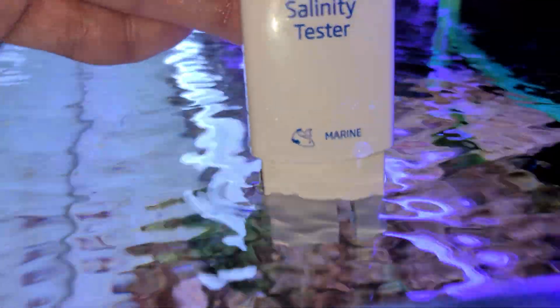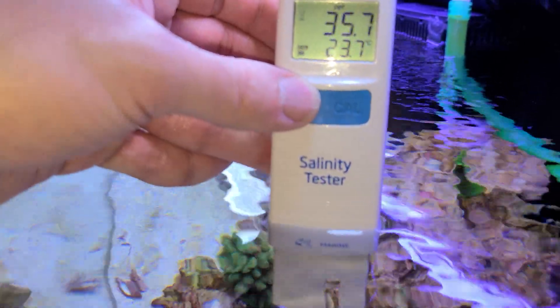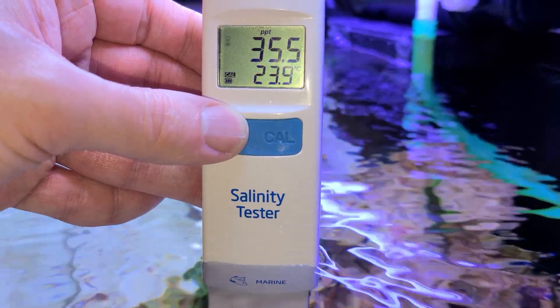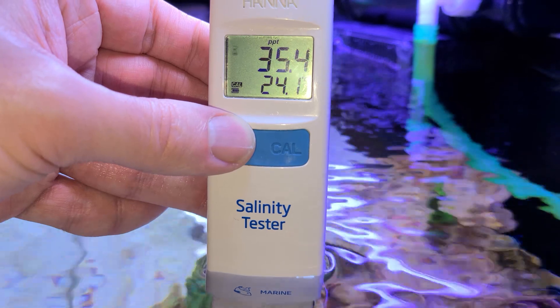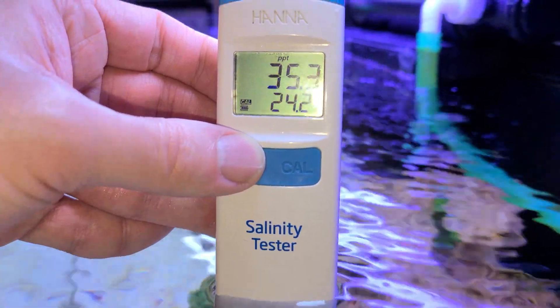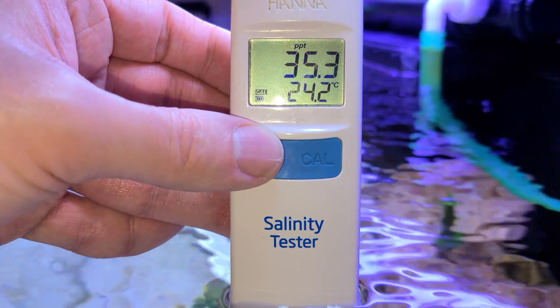The device is now ready to use and you can go ahead and test your salinity. The reading actually takes a few seconds to settle. I'm looking for 35 parts per thousand and it's settled on 35.3 — that's close enough for me.